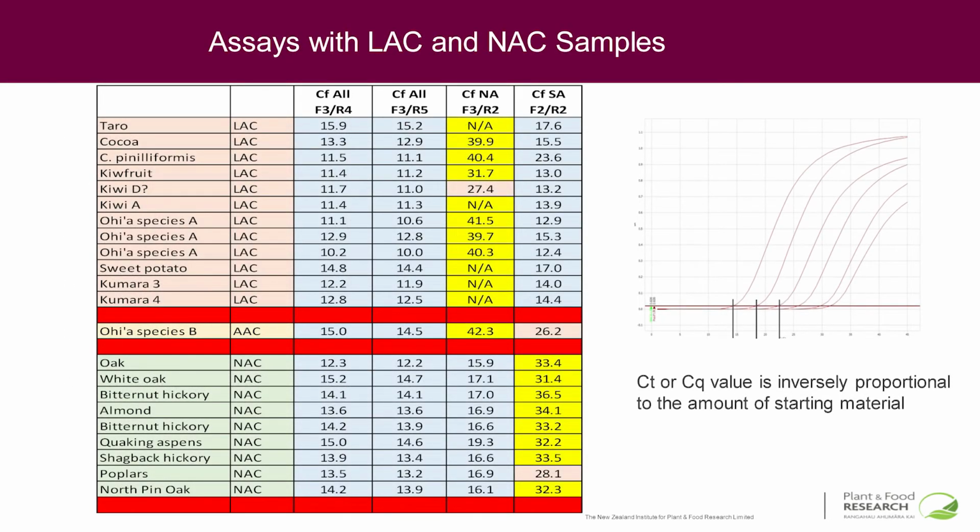Okay, so, yes, don't worry about reading the data that's in here. These are CT numbers. Now, the CT value is with real-time PCR: you have a threshold, there's fluorescence that gets incorporated into it, and the cycle number that it takes to get to that threshold is your CT value. And the lower that number, the more starting material you have. So it's sort of inversely proportional.